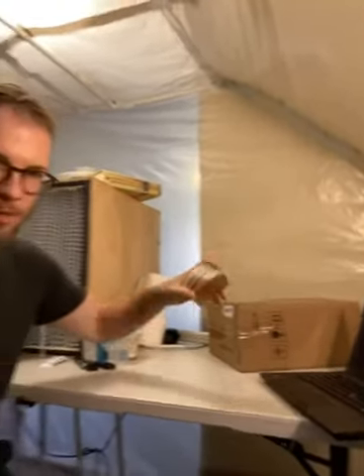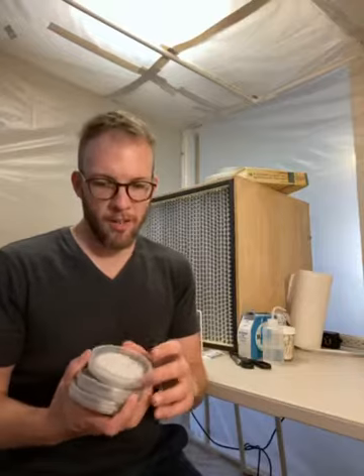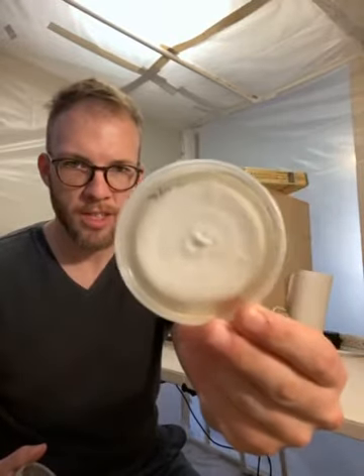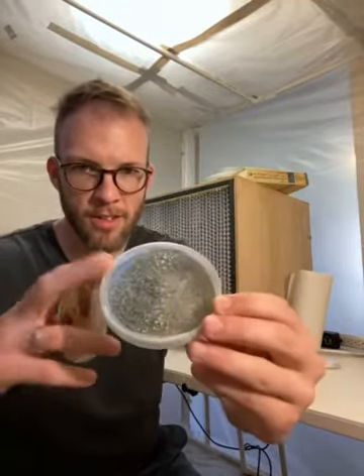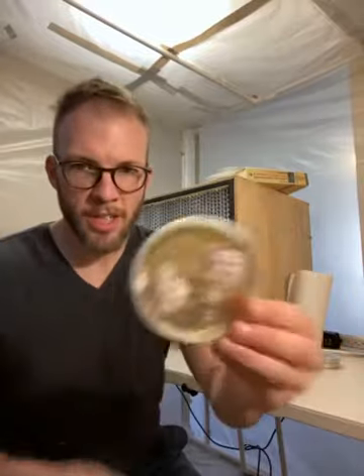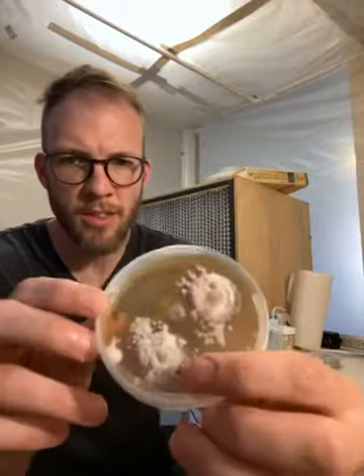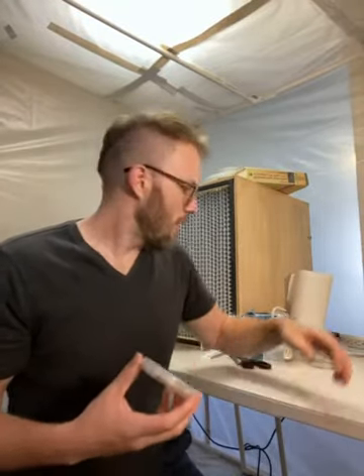One of the things I've been doing as part of learning microbiology and genetic engineering is isolating cultures I find in my general area. I have a couple here: this is probably some sort of cheese mold I found on cheese, then I have a random one I found in the wild with a lot of spores. This one I'm particularly interested in — it looks cool, and it's producing what I think are metabolites, but I'm not sure what species it is.